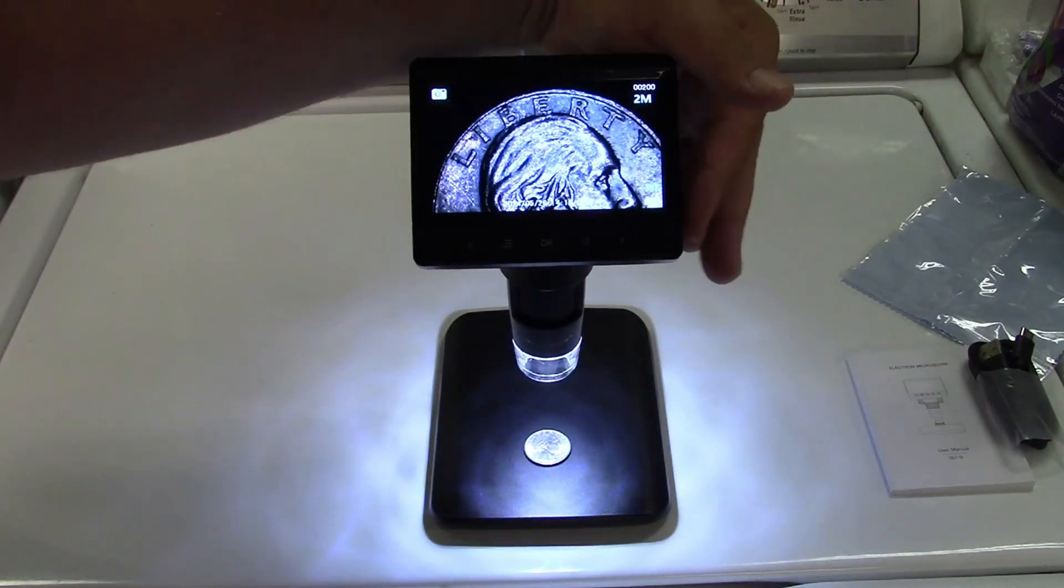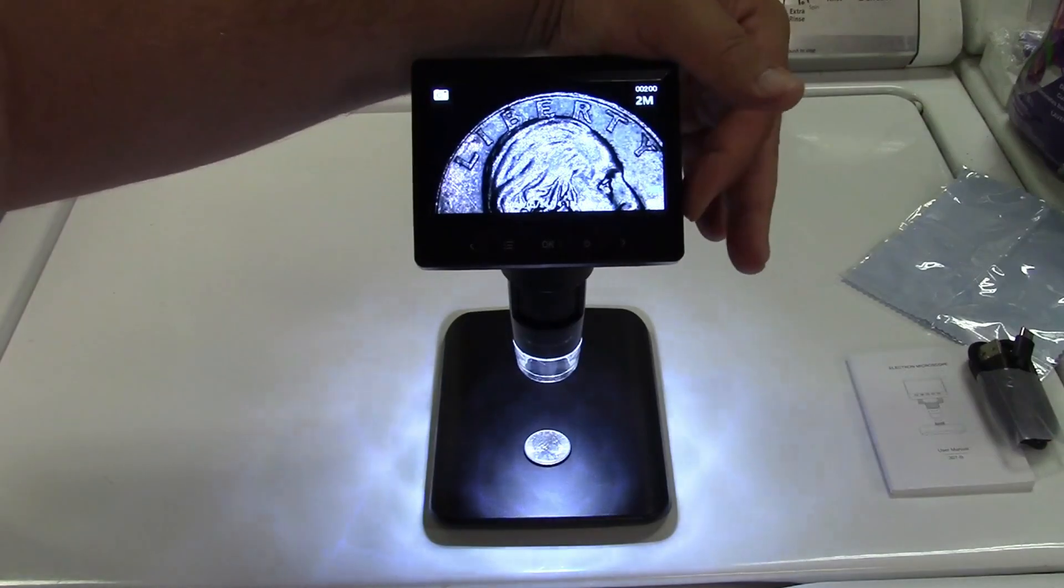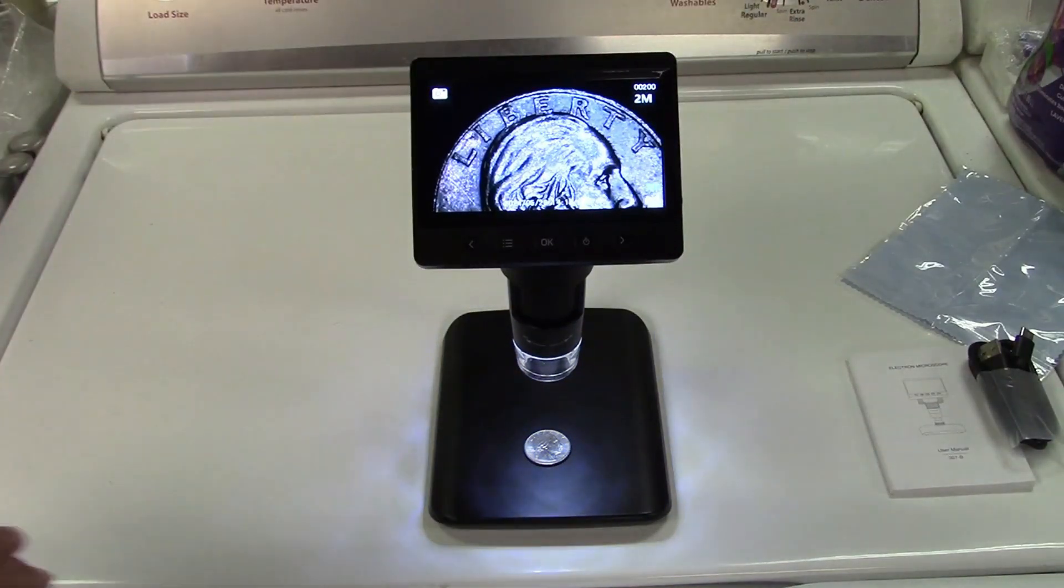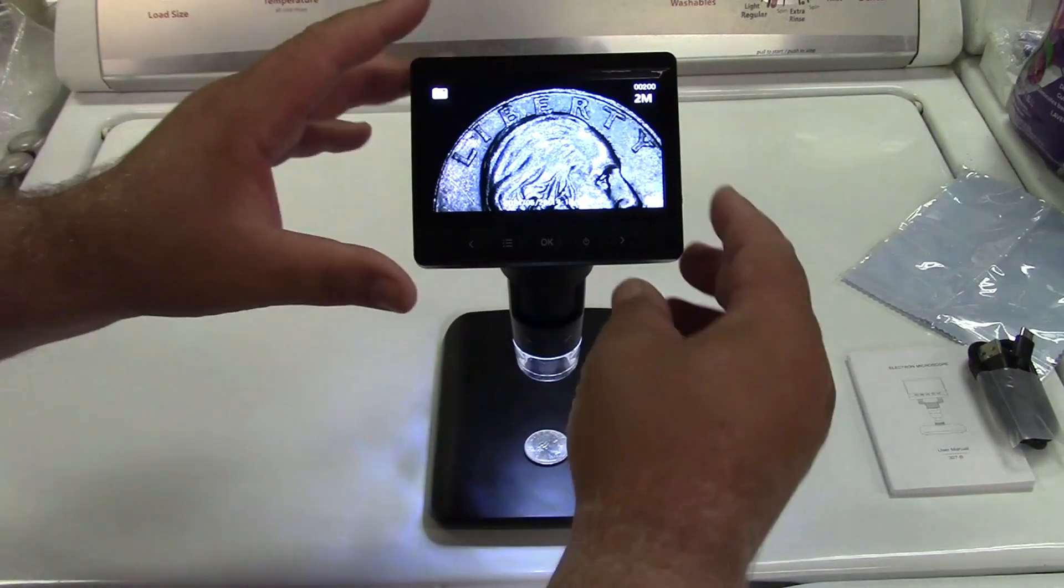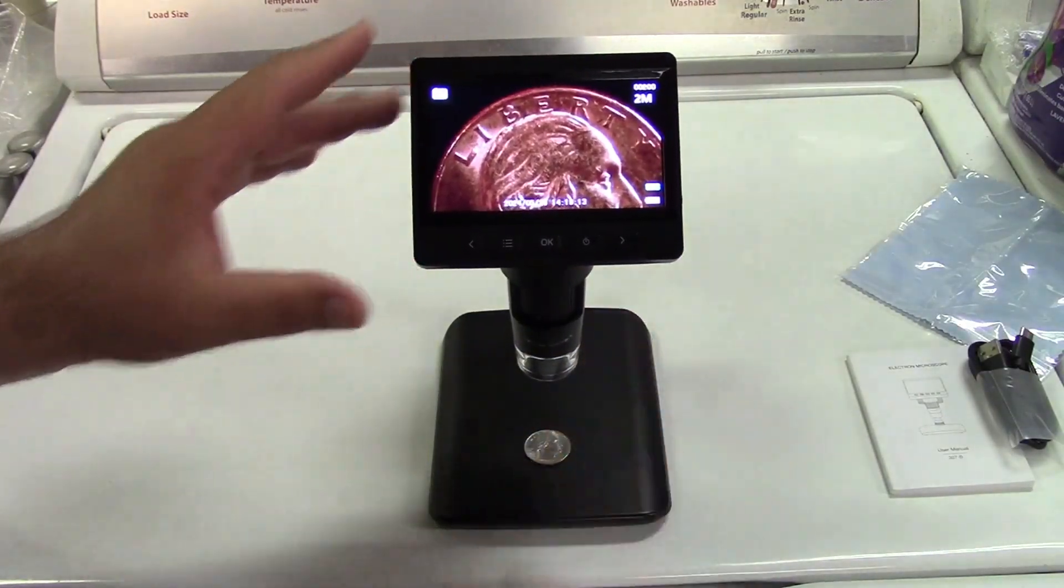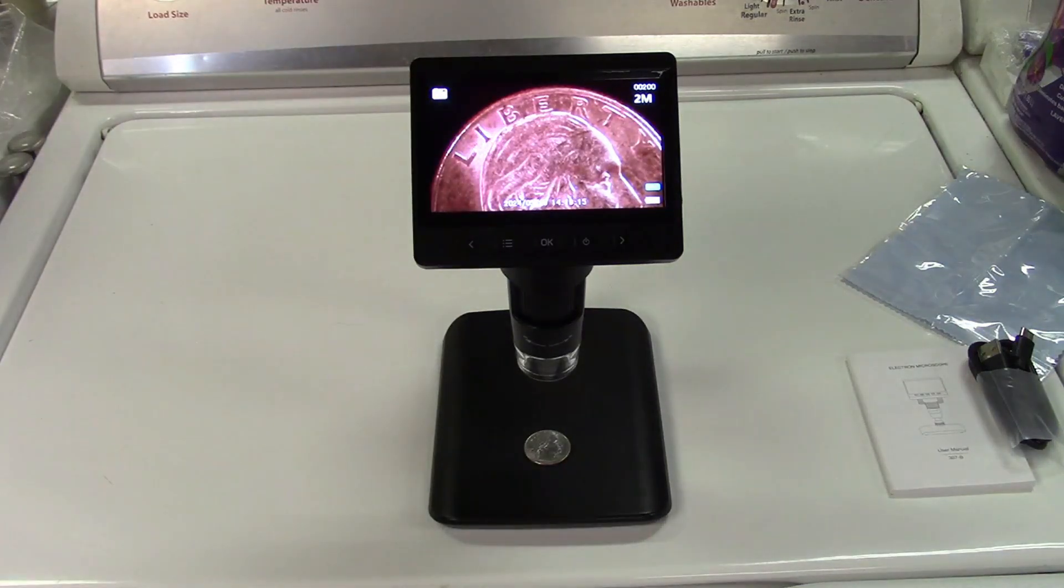We can adjust the brightness. The microscope compensates for that. But you don't need it at the highest brightness to see it. In fact, you could shut it completely and that's just with the room lights right there.